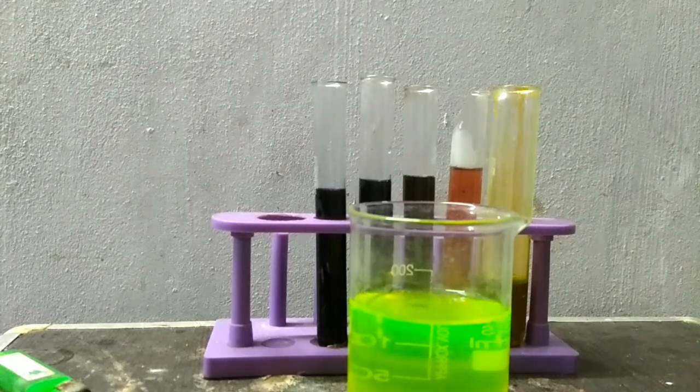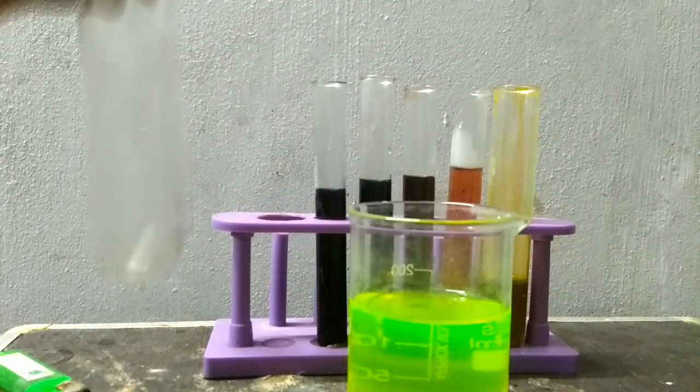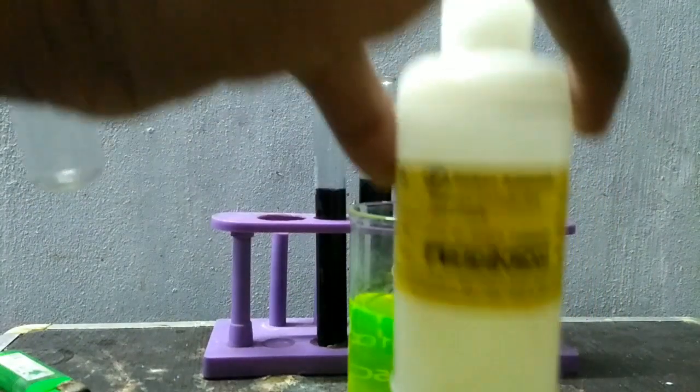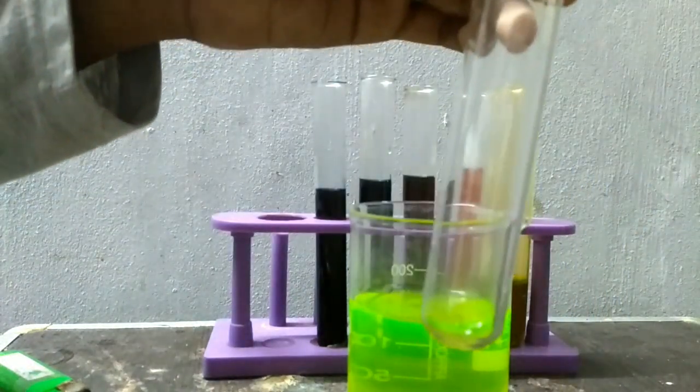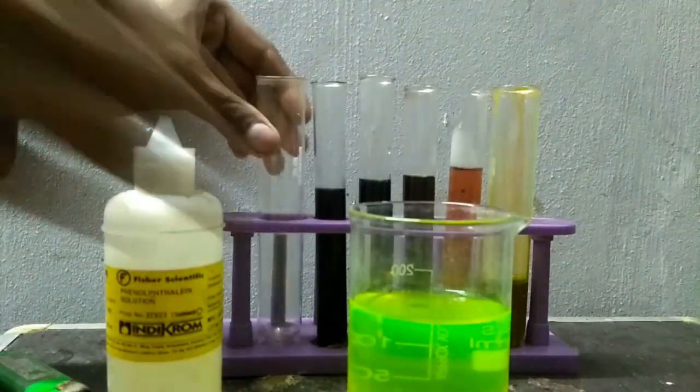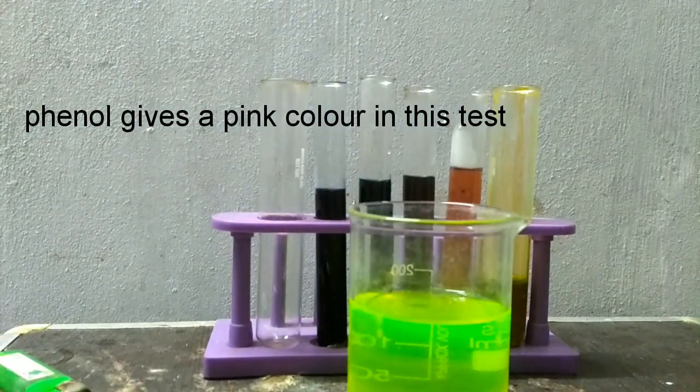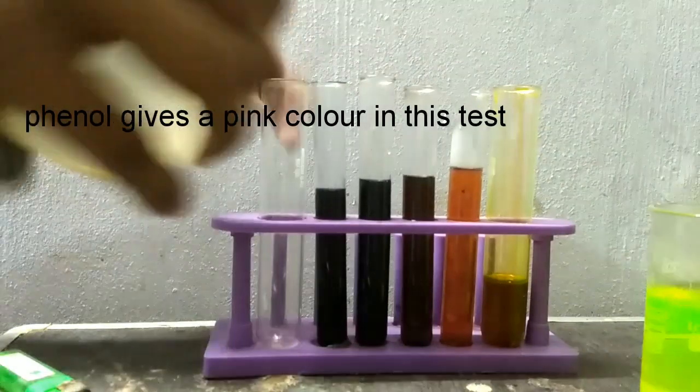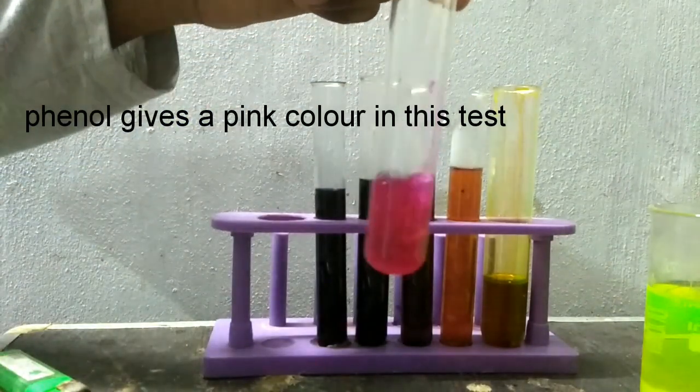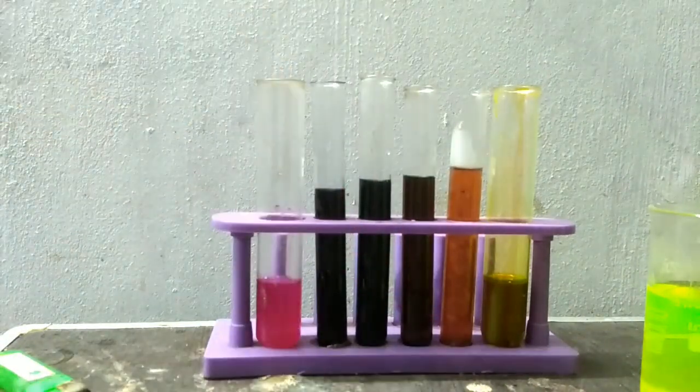I did not have phenol. So I am showing you the color of phenolphthalein from the phenolphthalein indicator solution I had. I will take a few drops of phenolphthalein in the test tube and then add sodium hydroxide to it. And you see there is development of a pink color.